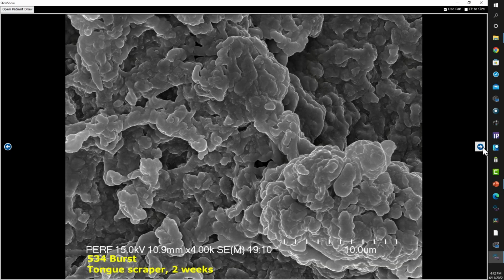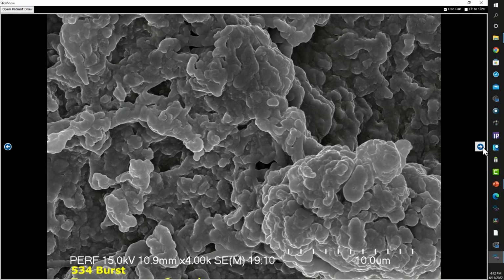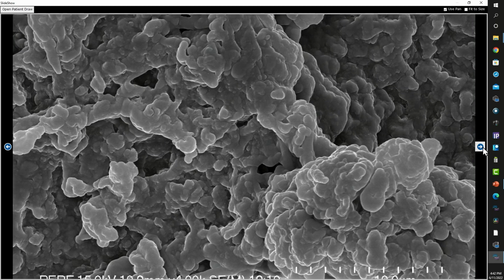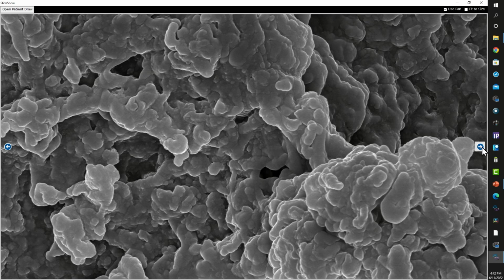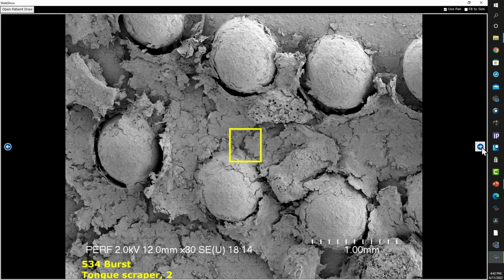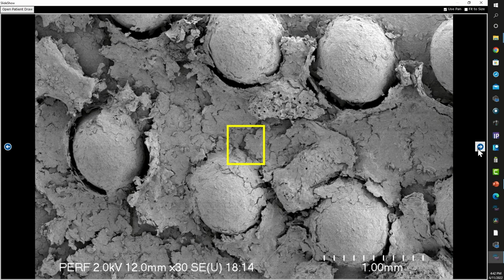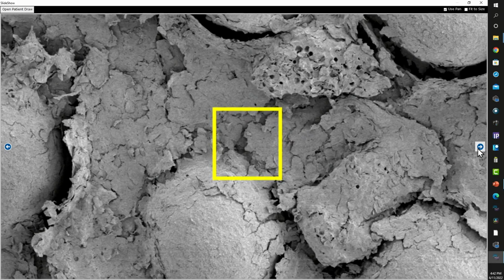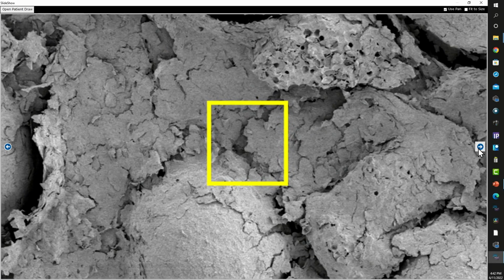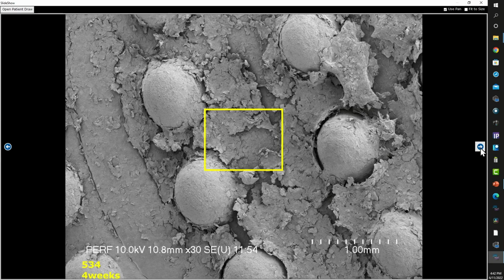This is a 2-week biofilm, and already it's hard to make out individual morphotypes. And when we look at some other biofilms that have been on toothbrushes used for longer, like this one, you have a real problem in even identifying whether there are organisms there, although the entire structure is created by microorganisms.